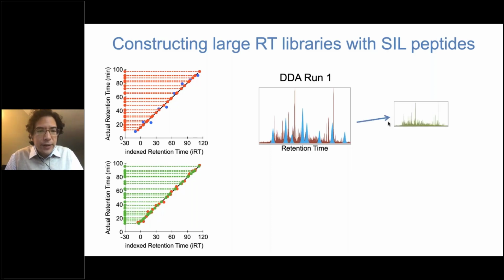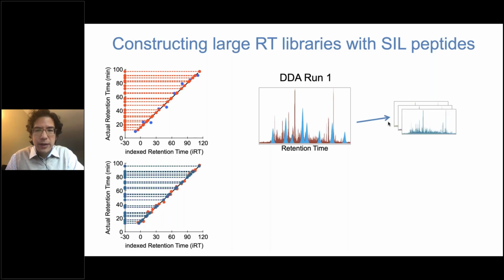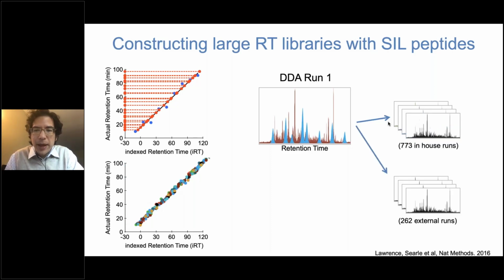But the idea here is you would take known peptides that are common to a lot of different samples that are just the equivalent of the BSAs and the actins and the keratins that are frequently found in all of your samples, use those as new IRT samples, and then map them to a series of additional other runs that you could collect in your lab. And so this is a way for developing these sort of mega libraries across many different samples.